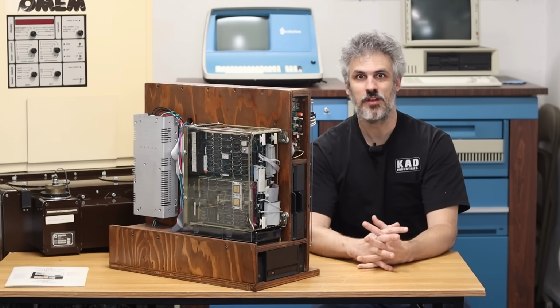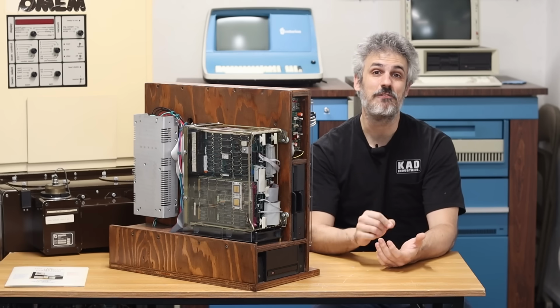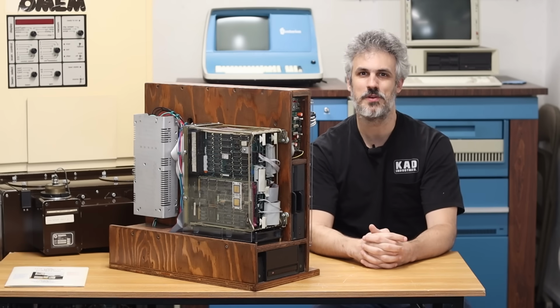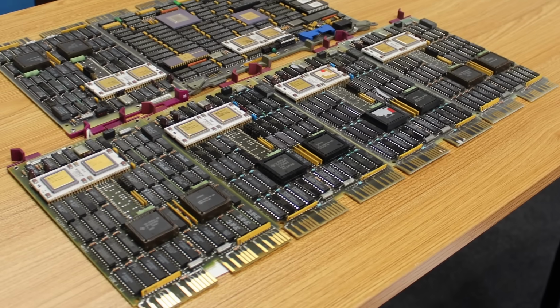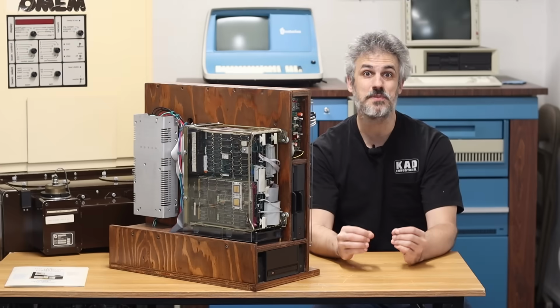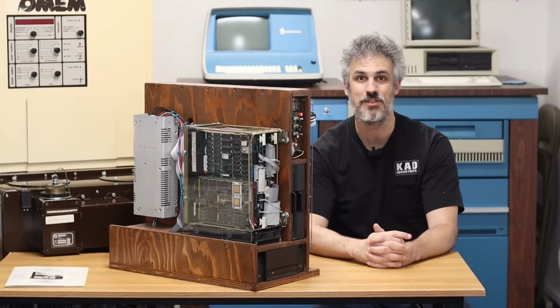Fortunately, I have all of that. This is actually how I first met Mike. While the Bomem DA3 is absolutely still valid and in use today, the computer has long since been retired and replaced with far more modern stuff. But I'm a bit of a fan of old PDP 11s, and Mike wanted to see those 11s go to a good home, so he hooked me up with a bunch of parts that just so happened to be absolutely everything necessary to get a PDP 1173 hooked up to a Bomem DA3.